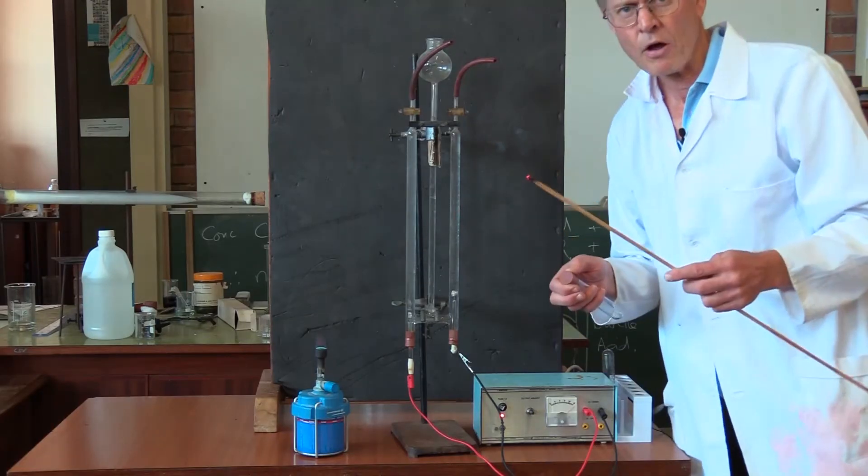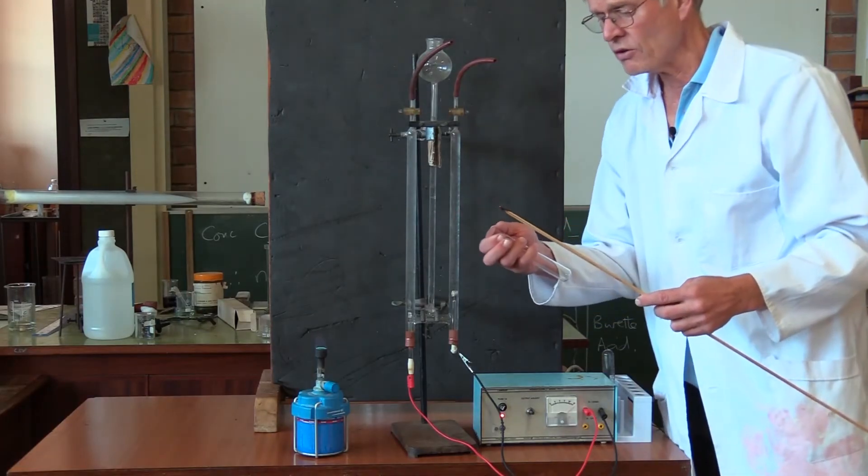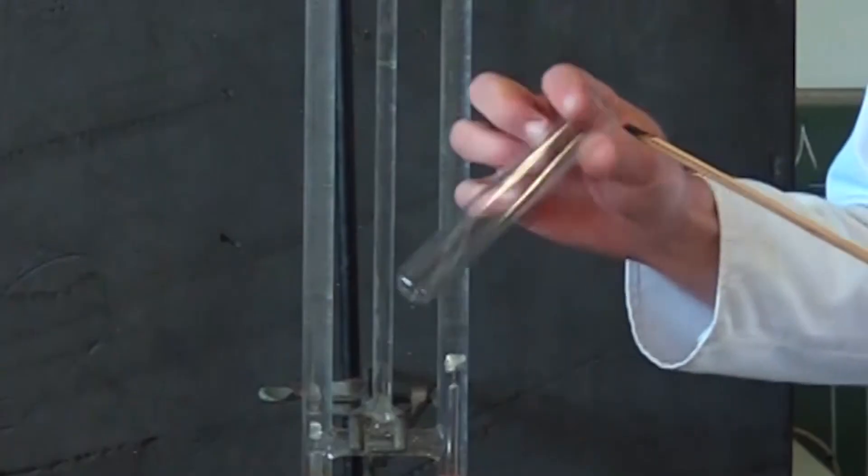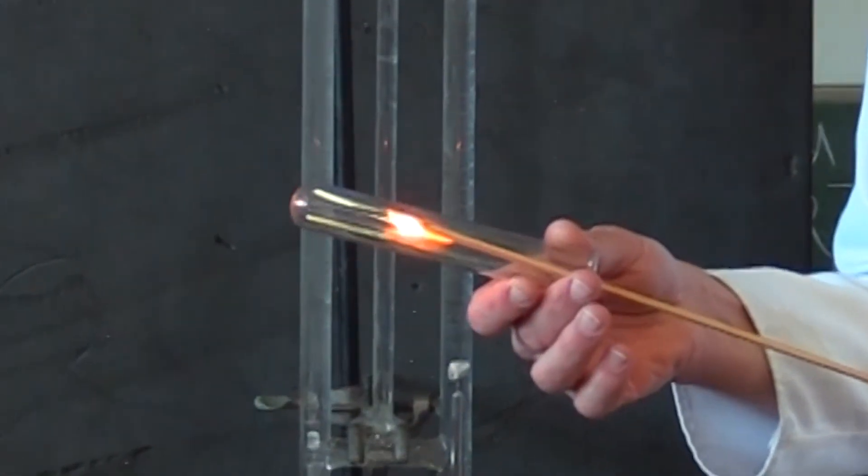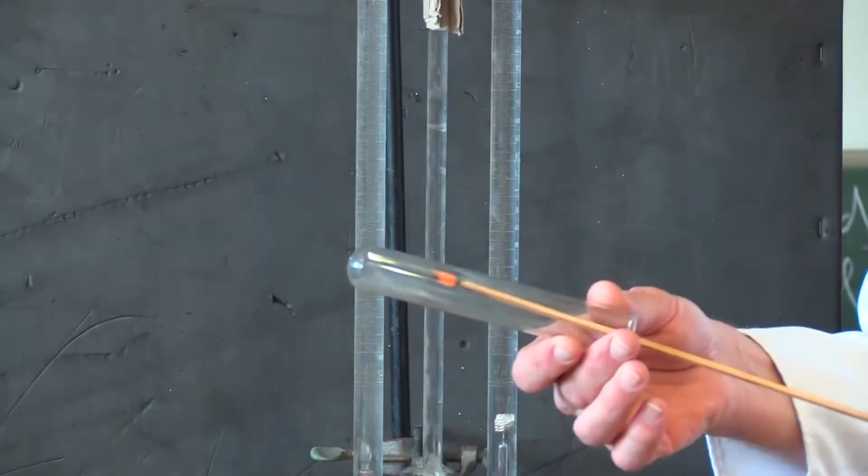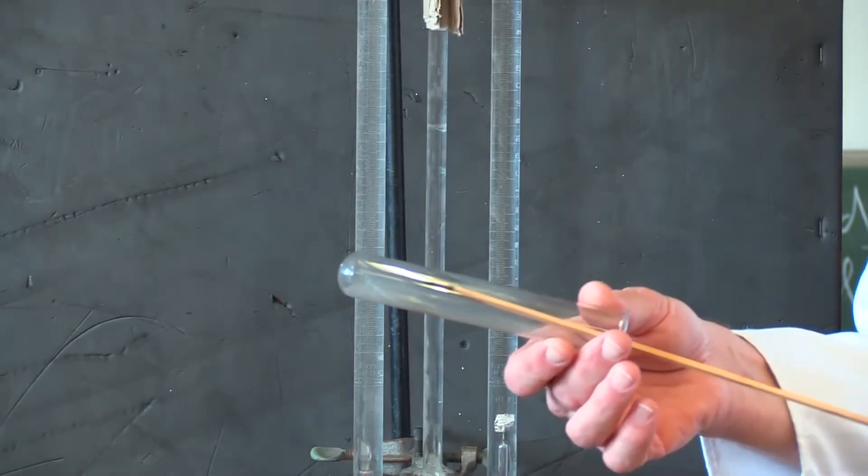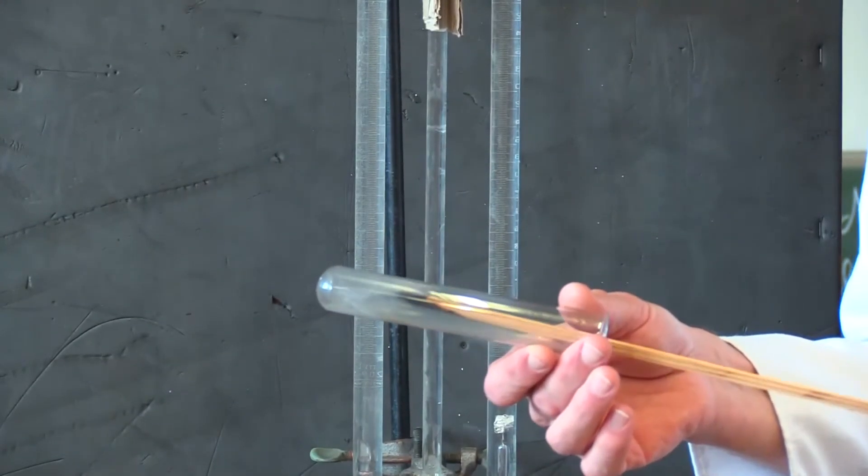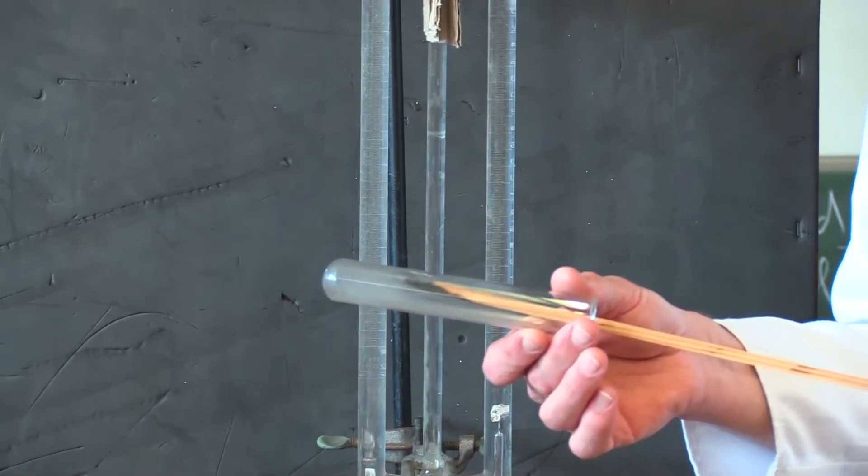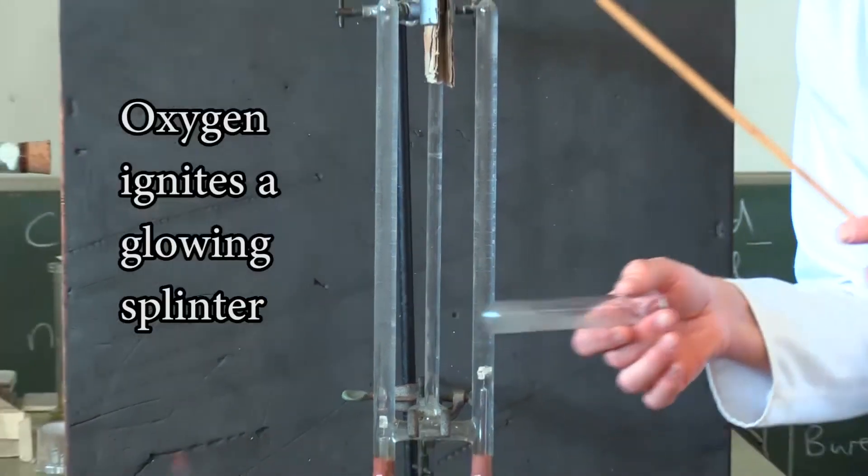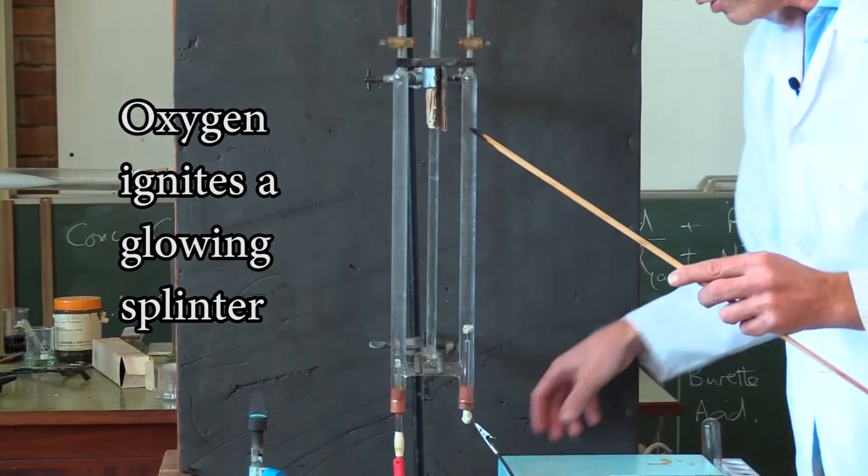Now I blow the splinter out, and I'm going to put it into the tube that's got the pure oxygen in. Can you see there? Oxygen supports combustion, and it made it not only glow brighter, but actually burst into flame. So, pure oxygen will make a glowing splinter ignite and burst into flame.